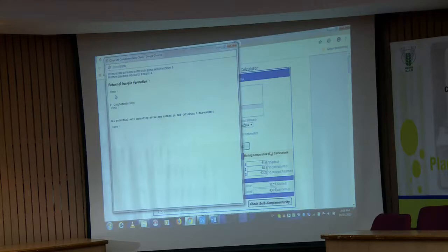Then whenever required, you dilute that primer to the required dilution, maybe 10 picomole or 5 picomole, as and when you want. And that stock, immediately freeze it at -20, because primers are very prone to degradation, because this is a small single-stranded nucleotide only.